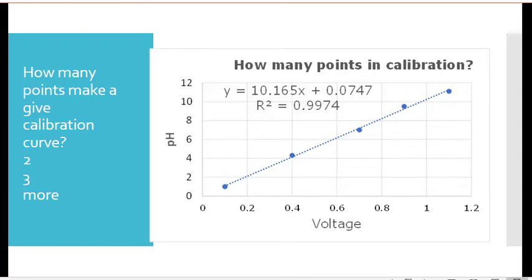With that in mind, we're just going to take a single pH point, and then the pH meter responds with voltage. I'm just trying to show you that the instrument itself, if we say that we're reading a pH, for example, of 4, that's because the instrument picked up a voltage of about 0.4. But we also know there's a plus or minus on that. We just proved that.